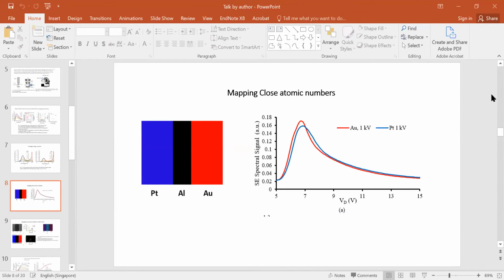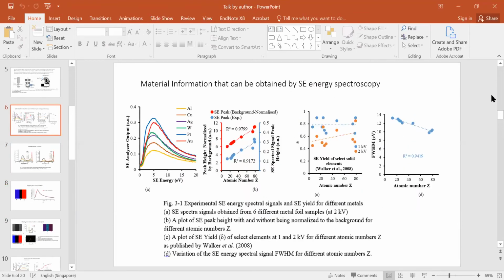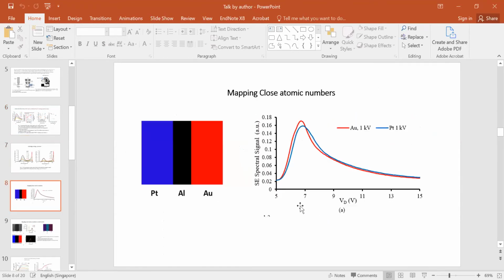Another thing, we were very surprised, but you might think that platinum and gold here are so close that you've got a linear relationship, but you can't distinguish them when you have very, very close atomic numbers. But it turns out that if you bias the specimen and increase your signal to noise, you actually get very reliable spectra where the gold peak is consistently higher than the platinum, and the platinum peak is consistently broader.